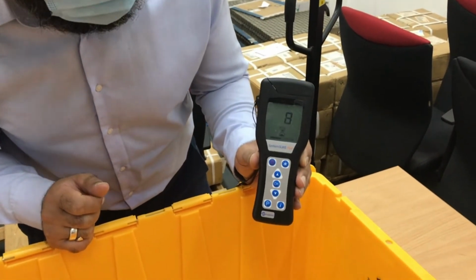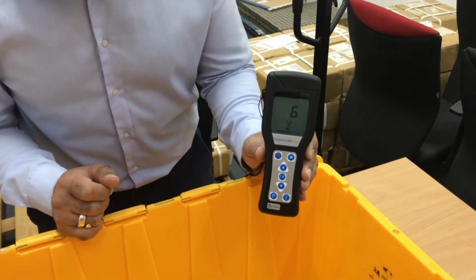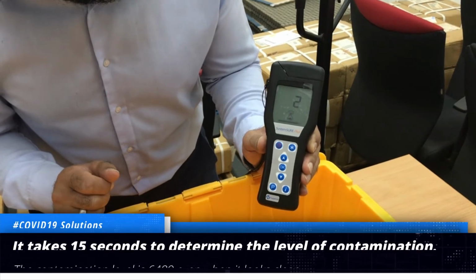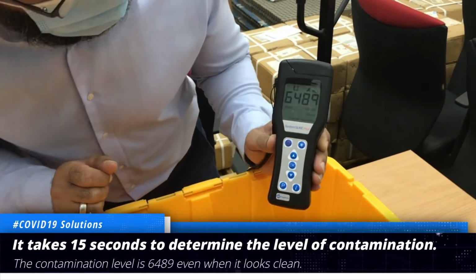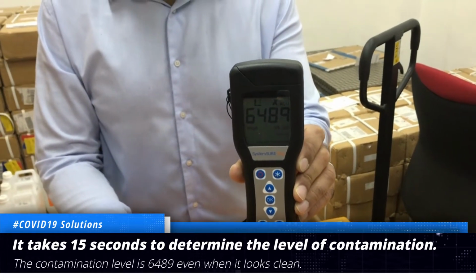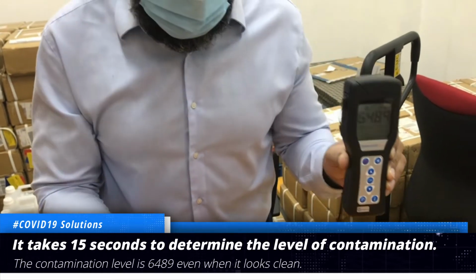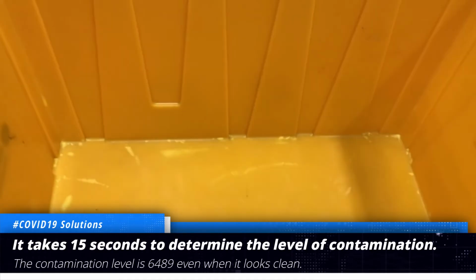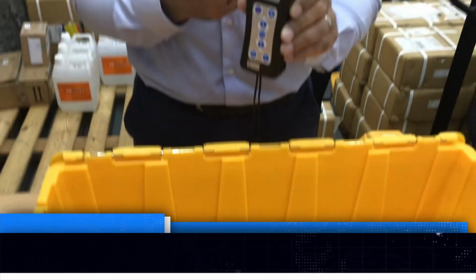So this takes 15 seconds in order to measure the amount of contamination. 6,000, so the amount is 489 6,000 and some numbers. And even though the surface looks clean, you have a lot of contamination there.